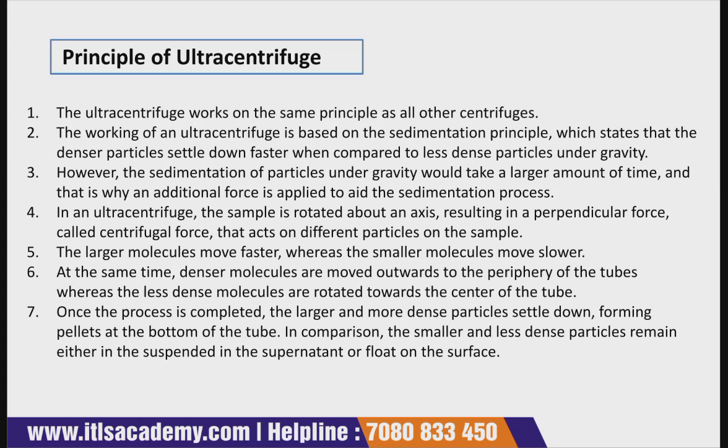The working of an ultracentrifuge is based on the sedimentation principle that we discussed in the previous lecture, that all centrifugation works on the sedimentation principle, which states that denser particles settle down faster when compared to less dense particles under gravity. However, sedimentation of particles under gravity takes a larger amount of time, and that is why an additional force is applied to aid the sedimentation process.